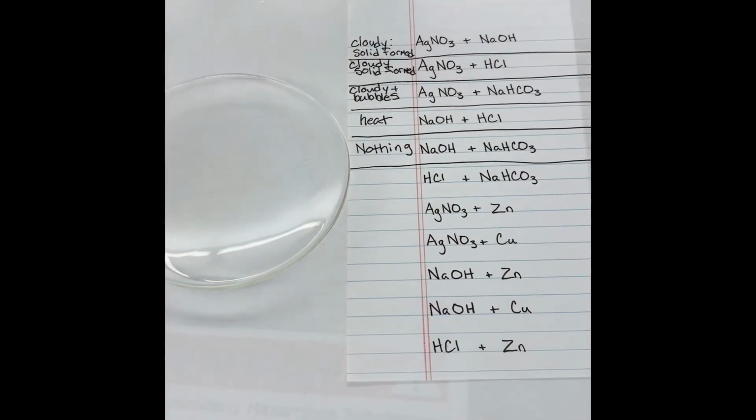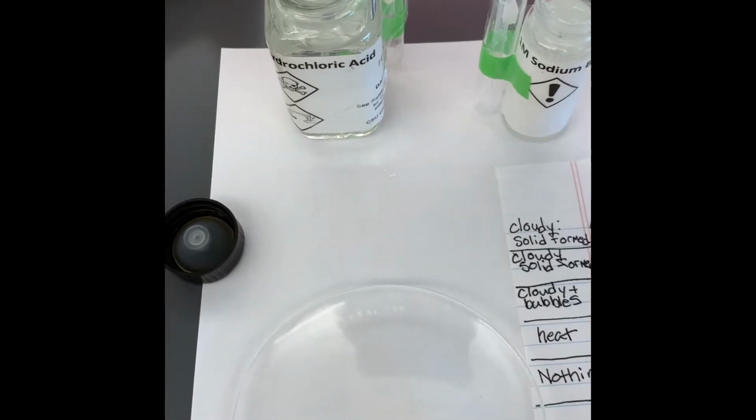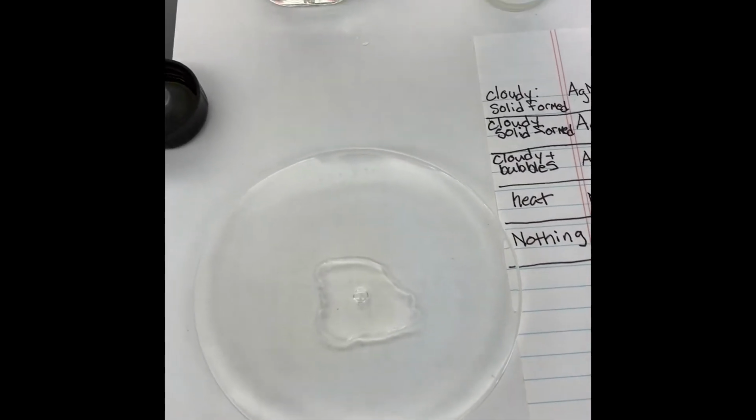Let's look at hydrochloric acid and sodium bicarbonate. There's our HCl.